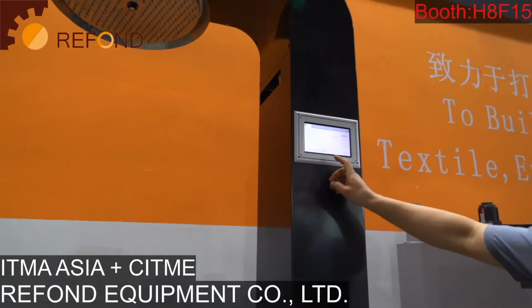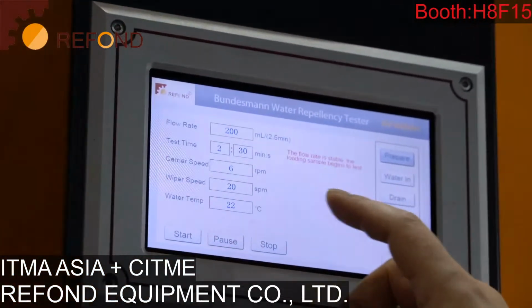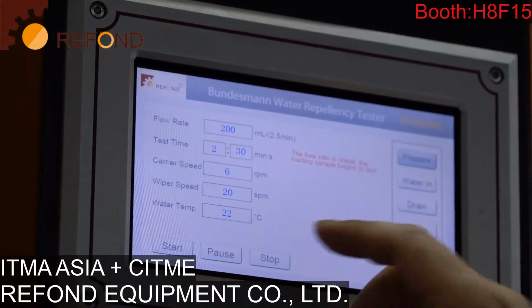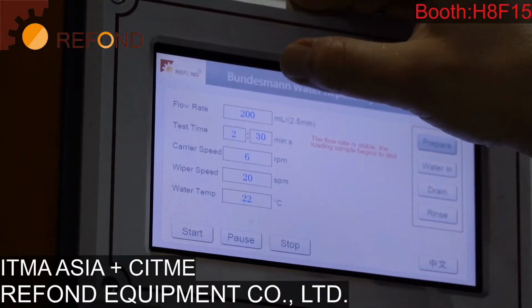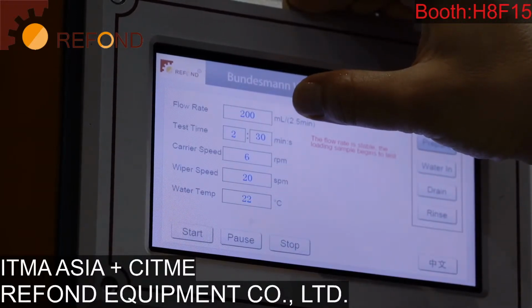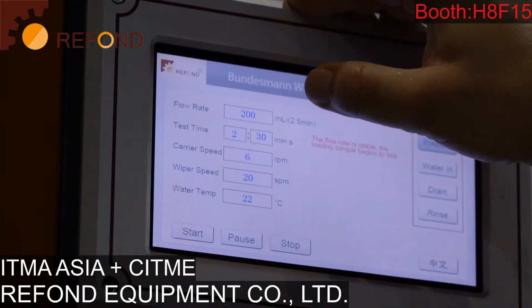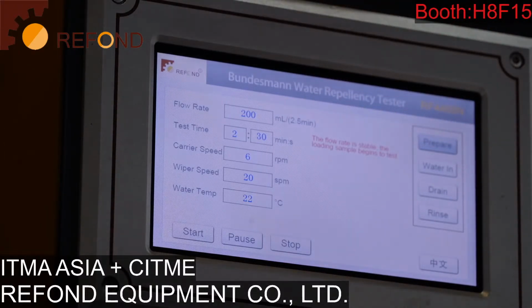Okay, so let me introduce the functions of our touchscreen software. In the ISO testing standard, the required flow rate is 200 milliliters plus or minus 10 milliliters in 2.5 minutes. In the old model of the testing machine, it is very hard to adjust the actual flow rate.